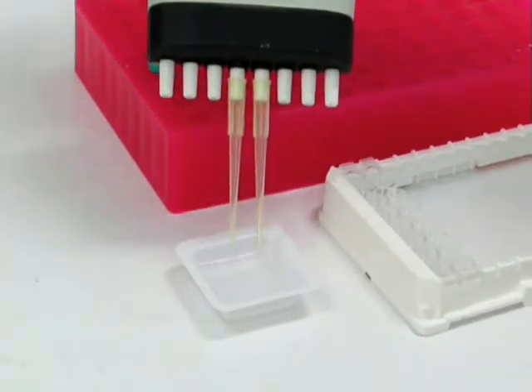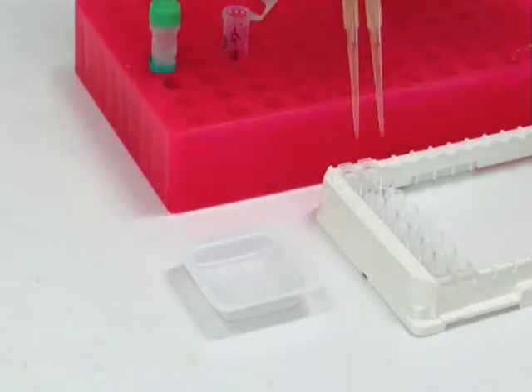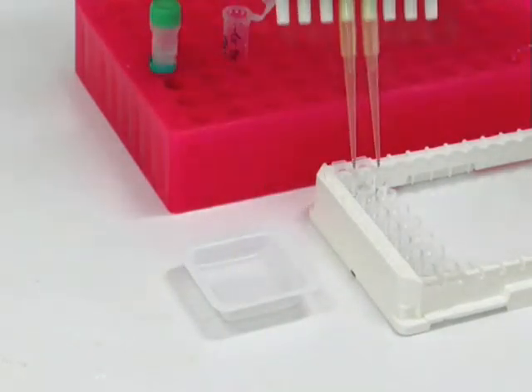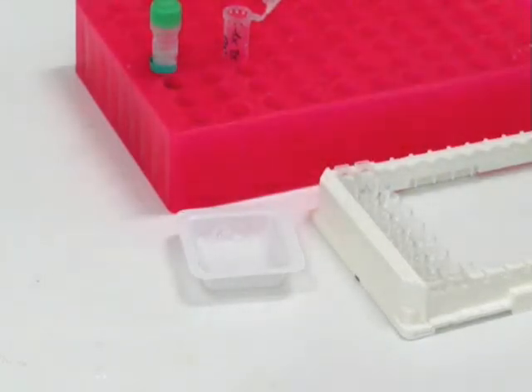Add 100 microliters of detection antibody to each well. Seal the plate and incubate on a shaker at 140 rpm for the appropriate time.